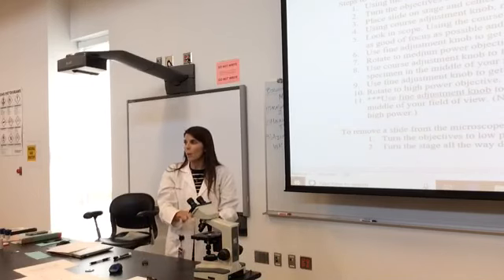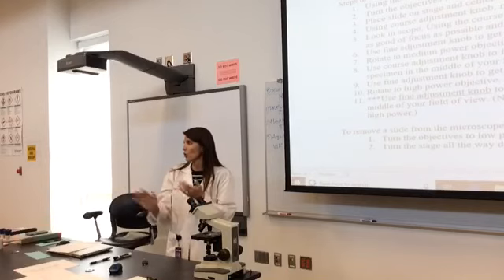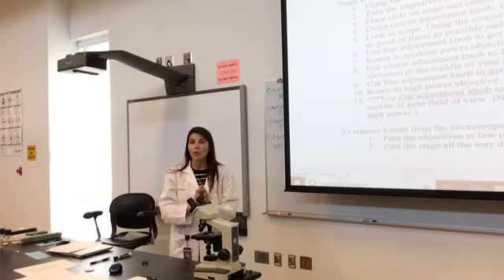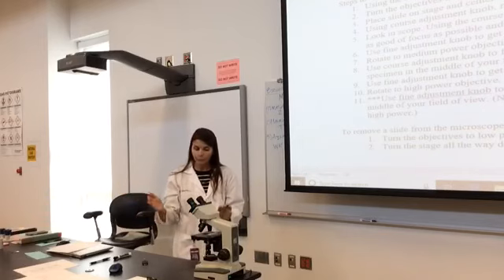If you did the prep work ahead of time like I did, I turned it on, I put it in front of that condenser, I adjusted the light, this should just take you, once you practice it, it's one of those things where you're like, oh, and it's done. I know that some of you it's going to take a minute, but doing the prep work ahead of time gets you pretty far, okay?